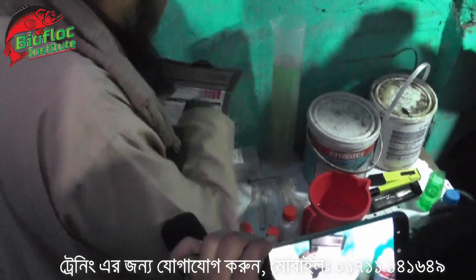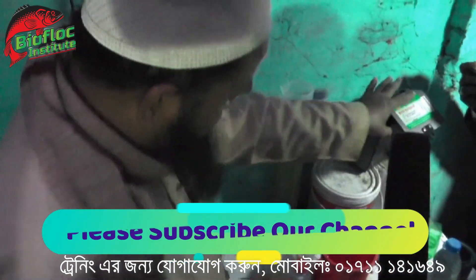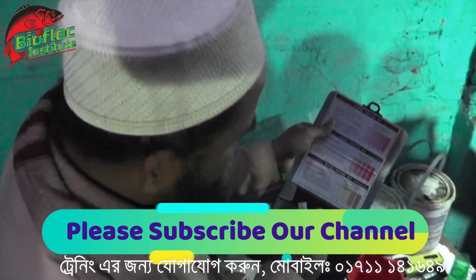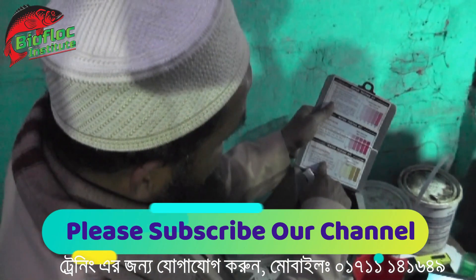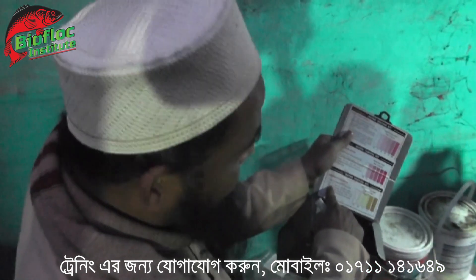You can see the color chart. Yes, you can see the color chart. Let us see. We are now going to the top. We are going to see the color chart. There are 5 ml of water. There are 5 drops of ammonia reagents. We are going to see the results in 1 minute.